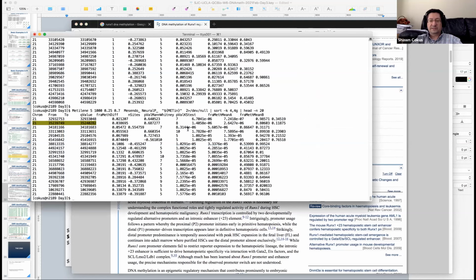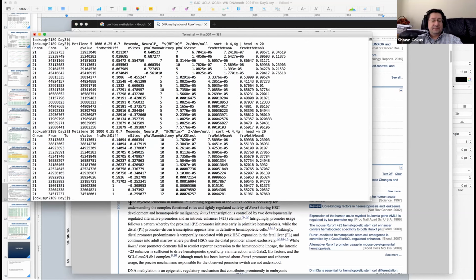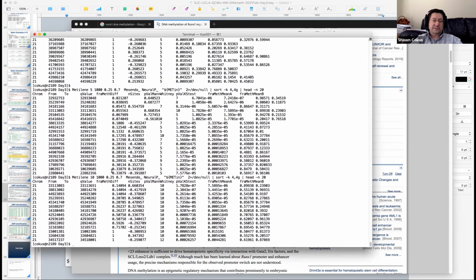We've got the next region. All right, so we're running out of time. But basically the way this is set up now is that you can rapidly tweak these parameters. Like, suppose I change that one to a 10, what happens? If you make your window big enough, you can actually see the previous run too, so you can see whether your regions are coming or going. This region seems to have moved to the top of the list now. The Q values got worse though.